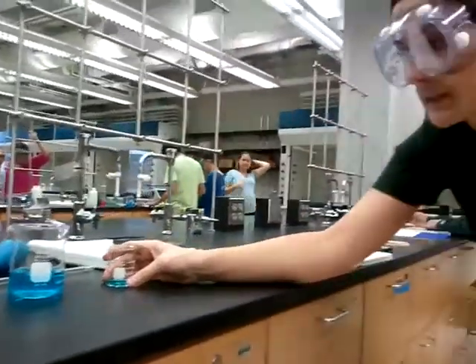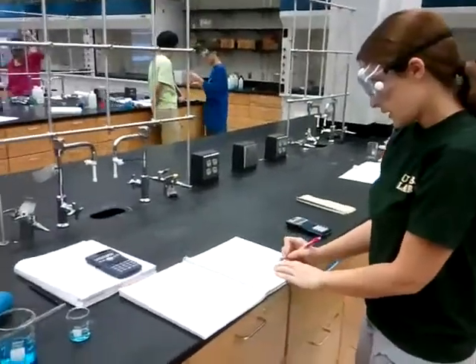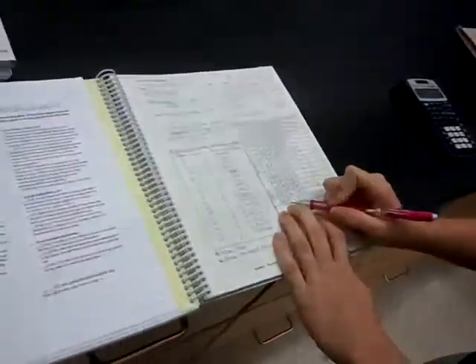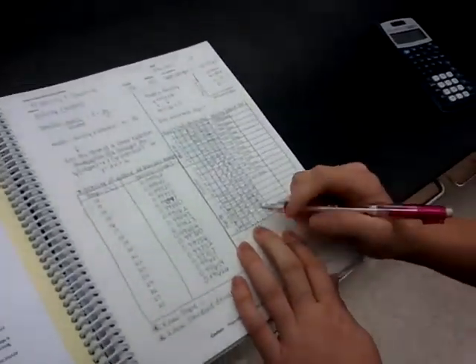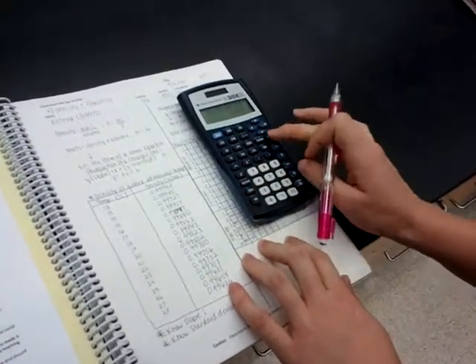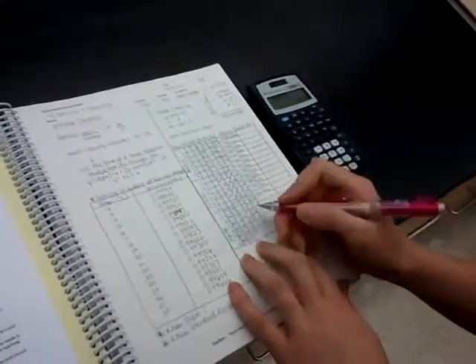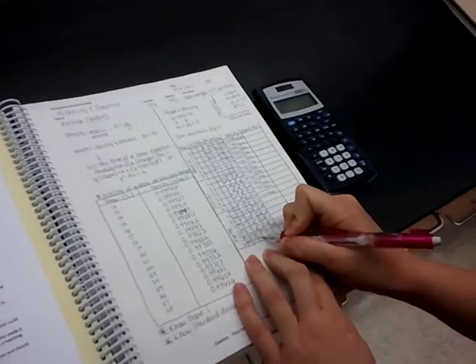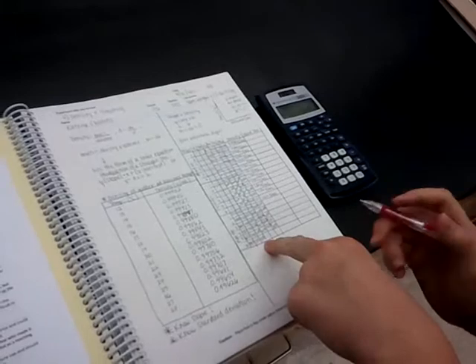Alright, now once we have it in our receiving vessel and everything has been measured, we want to make sure that we record everything that we do in our lab notebook. See here that I have the initial volume and the final volume, 44.2 and 100. I'm going to subtract the two from each other to get 55.8. And that is our actual volume.